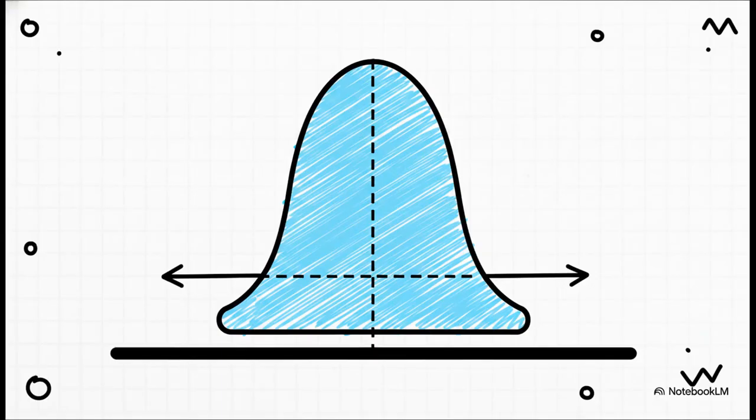In keeping with classical mathematical notation, these variables map directly to the visual anatomy of the peak we just looked at. Mu represents the retention time. That's the very center of our peak. Sigma is the standard deviation, representing the spread or width of the peak, while sigma squared represents the variance. Finally, y is simply the signal from our detector as time marches forward. It's so cool how the math perfectly aligns with the physical reality happening inside the column.